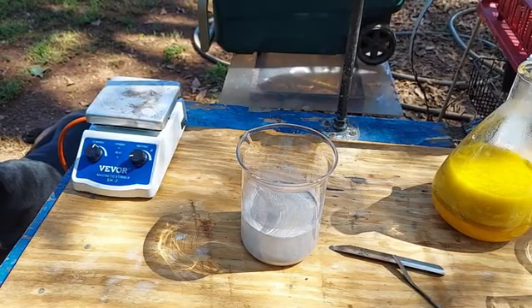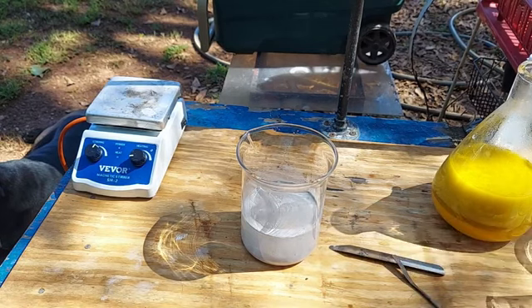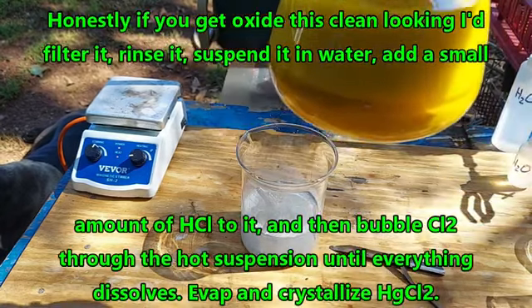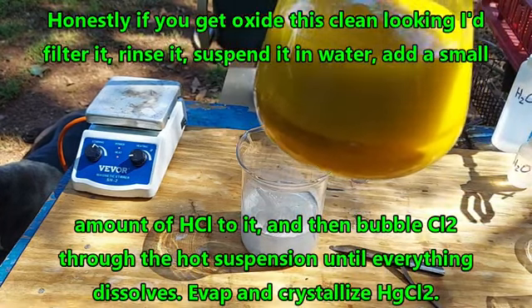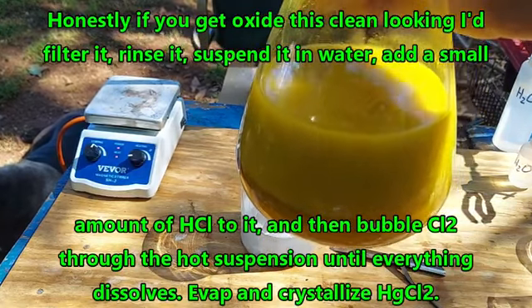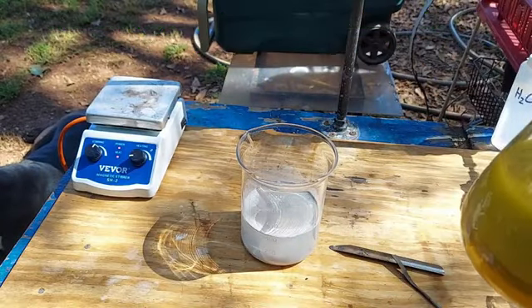I think what I'll do is I'll make some nitric acid and I will filter this off. And then I'll dissolve it in the nitric acid. That'll give me mercuric nitrate. And give me something to do with this here too after I filter it off. That's probably what I'll end up doing with it. But let me filter off this mercuric oxide here, and we'll have that, and we'll have this, and then we'll pick this up again in the morning.